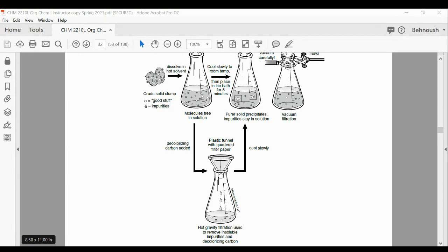Scraping the bottom of the, okay, or put seed of the crystals. Very good. When you scratch the inside of the glass, or you add seeds, or you do further cooling, that was another comment that you had, Katania, to increase the yield of the crystals. First of all, you want to make sure the temperature is very low.